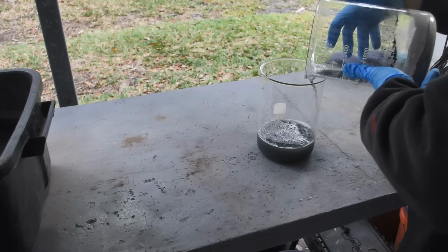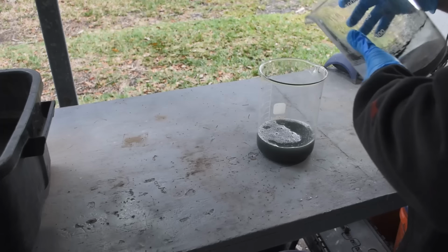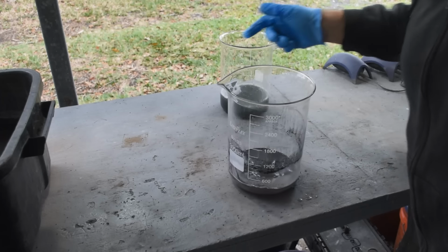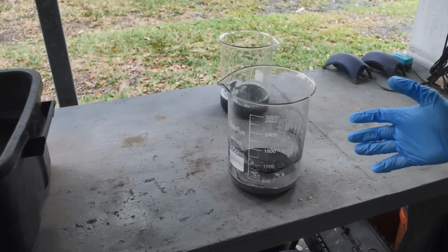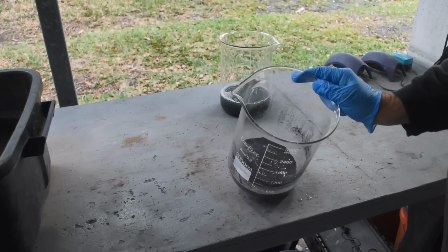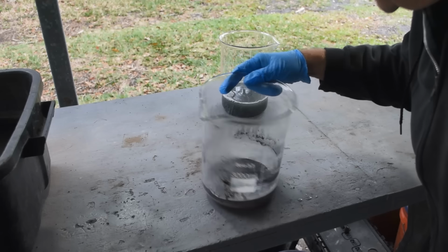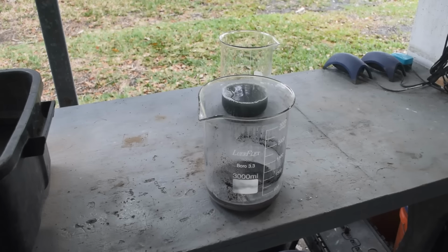My process for extracting gold from e-waste has basically been one of extracting everything that isn't gold and leaving the gold behind, so it's much easier to get and much cleaner when I do get it. So this is going back in the fume hood for another quick boil. So I've been having a lot of trouble lately with leftover base metals, especially tin, in my stuff when I try to get the gold out. And tin is just a nightmare to deal with. And yeah, I think I see some little flakes of metal in there still. So we're going to give it another boil.